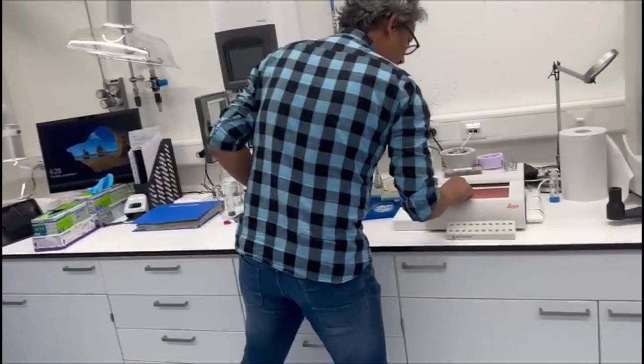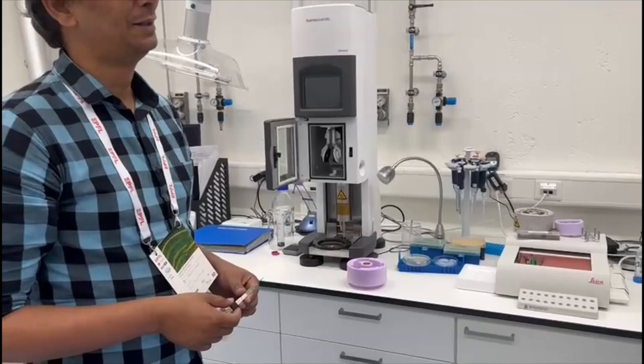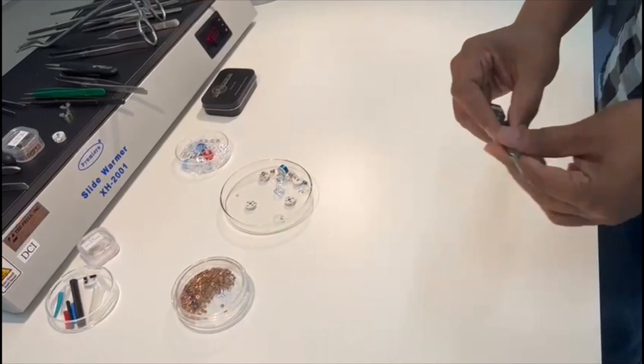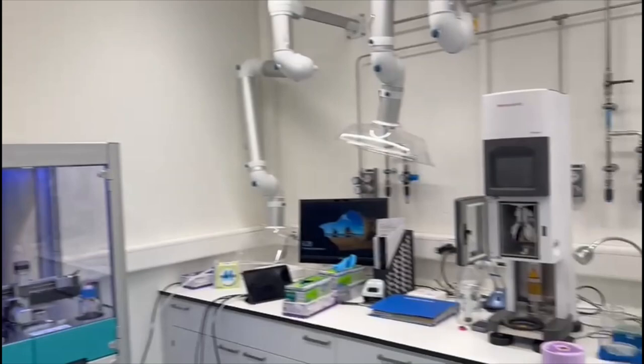Can we try one right now and see the process? No, I need to cool down. So we have these pieces, which are the TEM grids, which are three millimeters. You hold the ring and then you apply the sample.